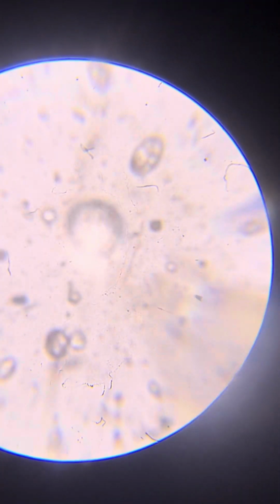So I'm having a problem to focus. This is because of calibration. So just give me a second. I haven't used the microscope in like several weeks, so it should be calibrated.